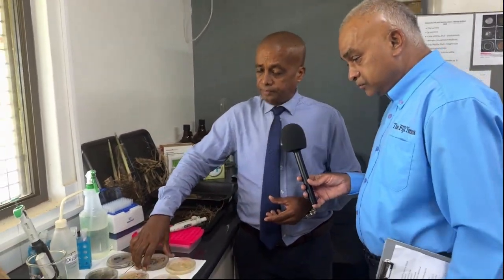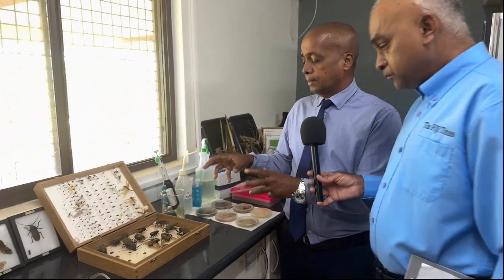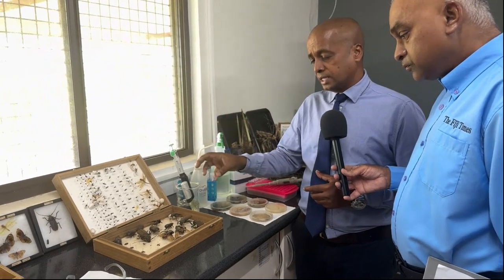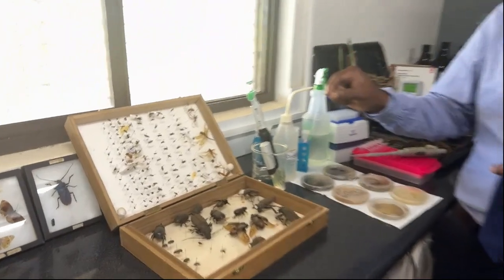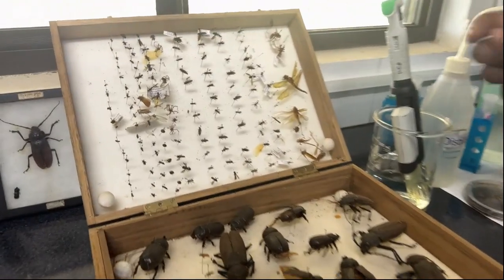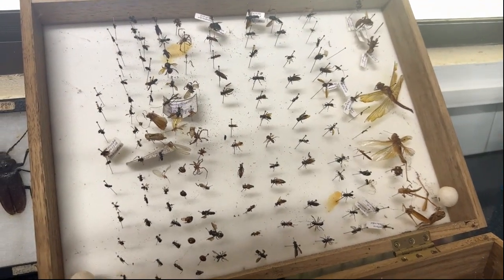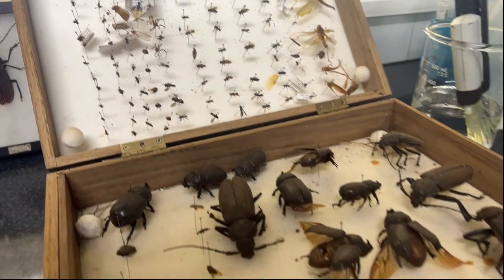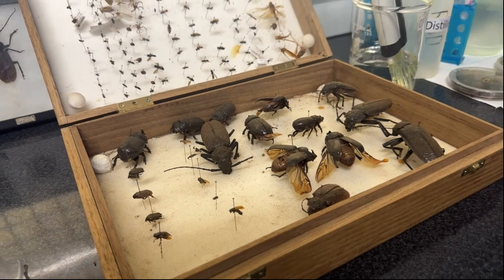If we move on here, you can see some of the pests. These are the insects that are in the sugarcane industry, as well as some of the insects that are out there in Fiji. And this is kind of our reference. When we collect one sample from the field, our entomologists bring it to the lab and compare it, whatever the insect might be. Are they beetles, and how do they affect the crop?